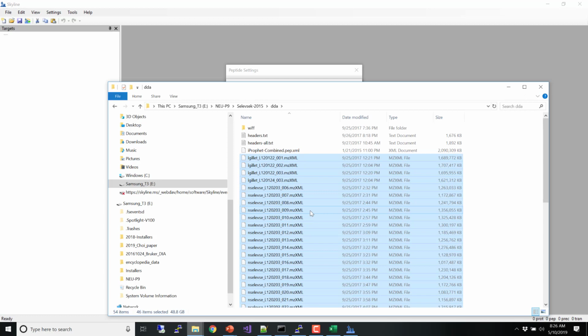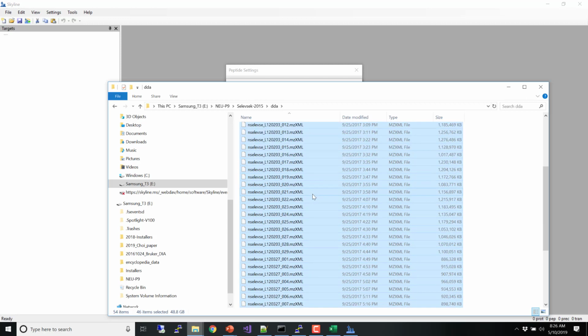You could either pool everything, or you could run DDA on both pooled healthy and pooled diseased. Or if it's going to be a time course, you could run either the entire time course pooled, or you could run each time separately, which is sort of what they did.